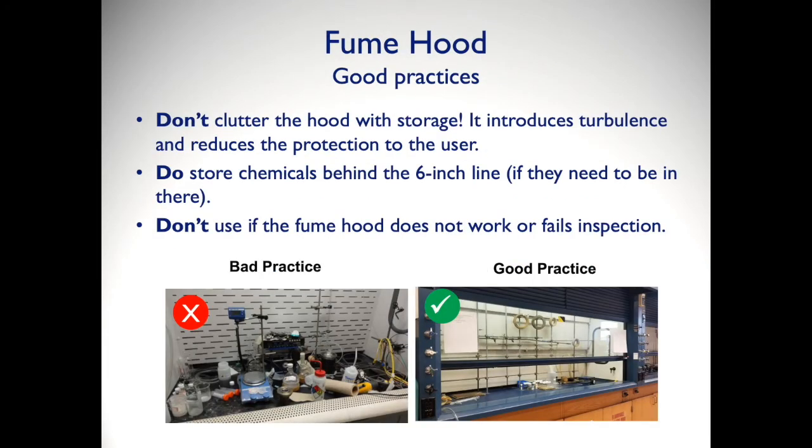There are some good practices on using a fume hood. Don't clutter the hood with storage. It introduces turbulence and reduces the protection to the user. Do store chemicals behind the 6-inch line if they need to be in there. Don't use the fume hood if it does not work or fails inspection.